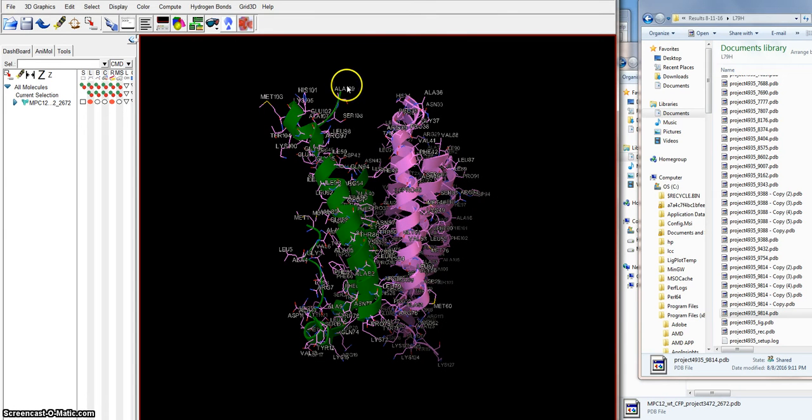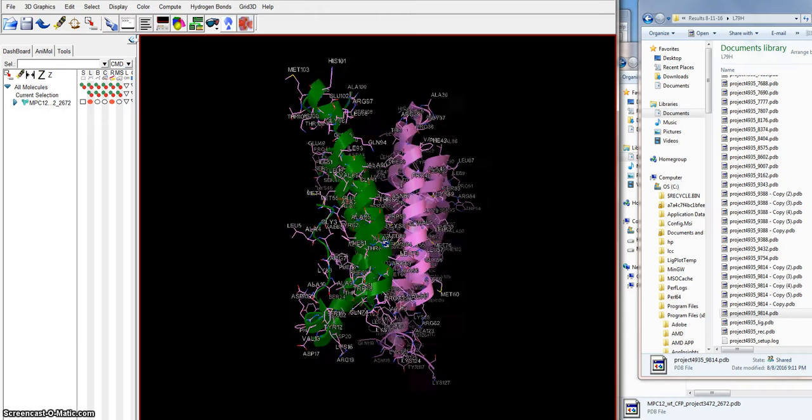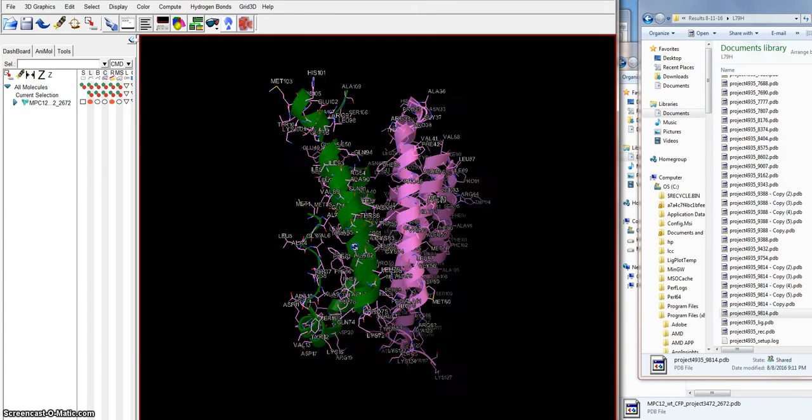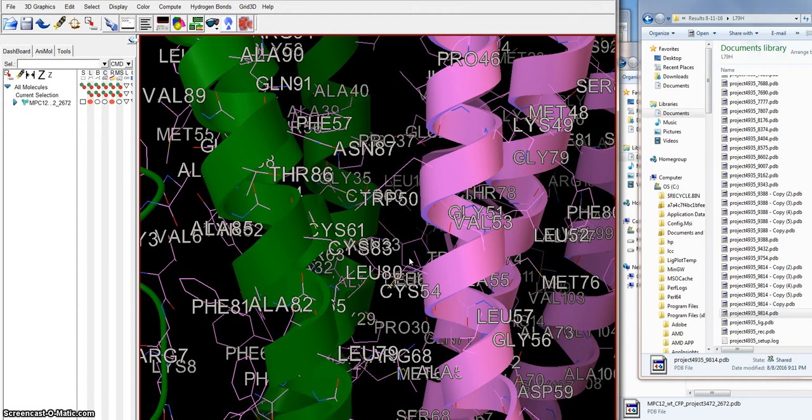Here's the C residue 109 at the top, being the mitochondrial intermembrane space, and then the N-terminus projected in the opposite direction, but still it's obviously sticking up. But anyway, that's the orientation. They are opposite.